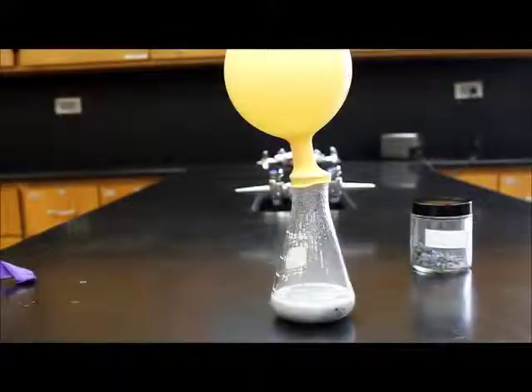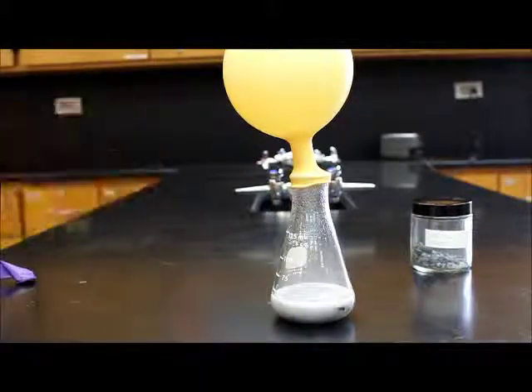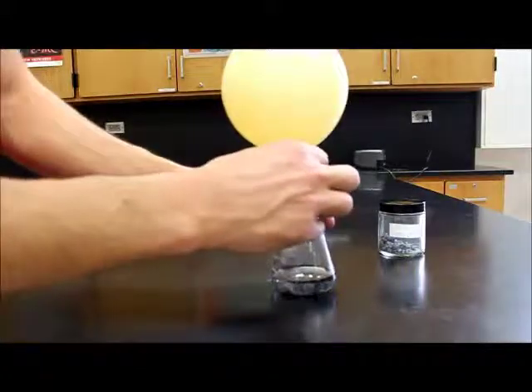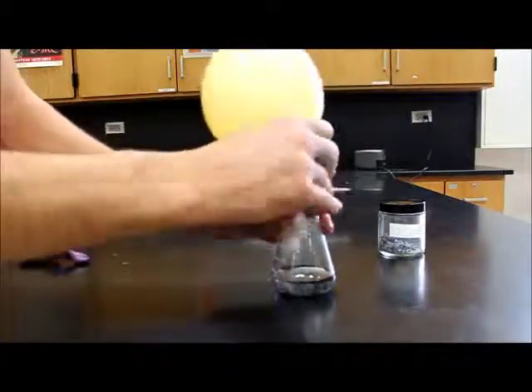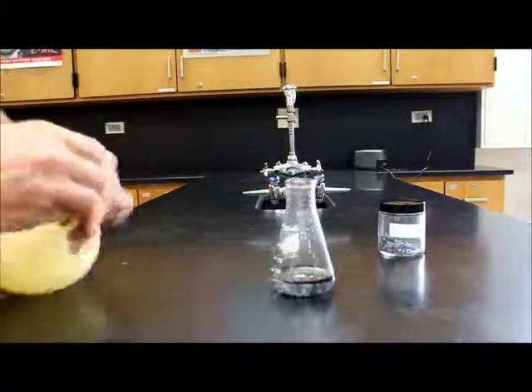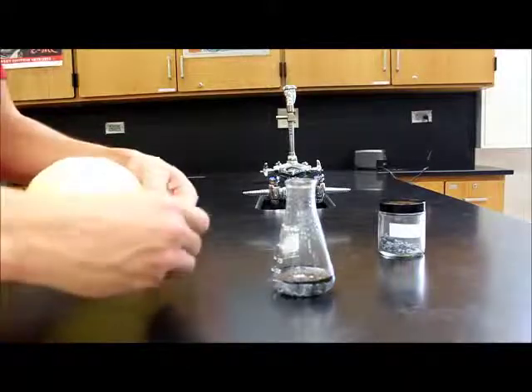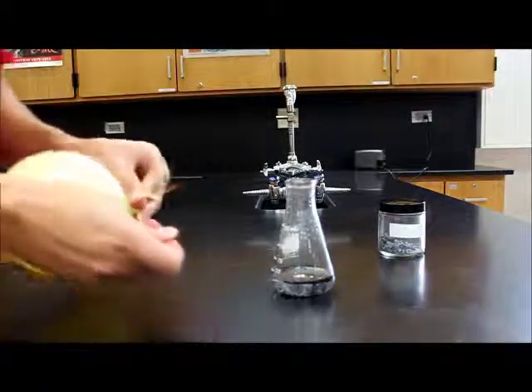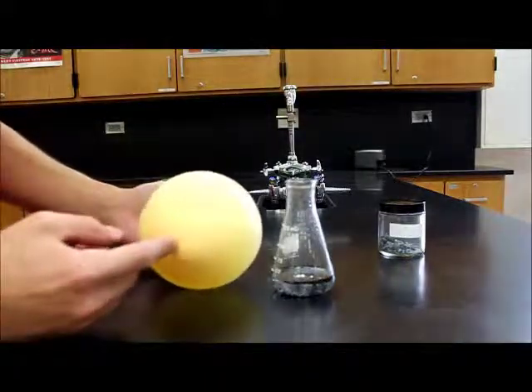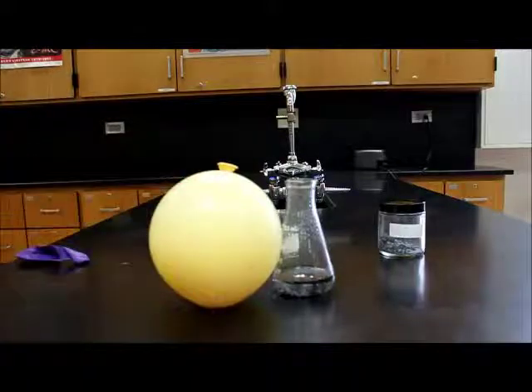As you can tell here, we're still producing hydrogen gas. We're starting to actually collect a fair amount of it here, and then we're going to use that for a demo we're going to do in a little bit. So when our reaction is finished, I'm going to try to seal off as much hydrogen as I can inside the balloon, and then seal my balloon. So in here is our hydrogen gas. We can measure how much hydrogen gas we actually produced.